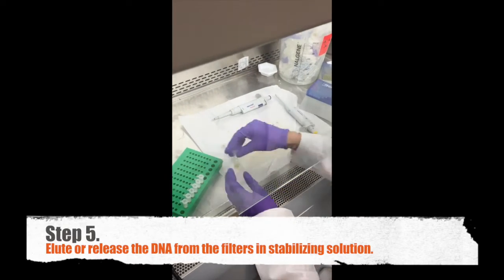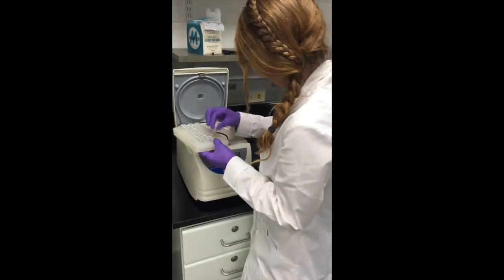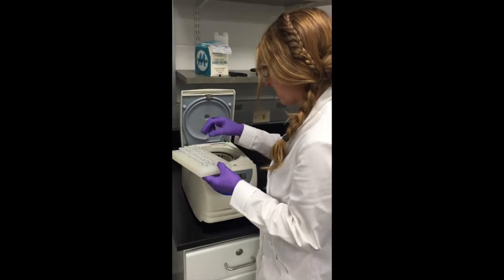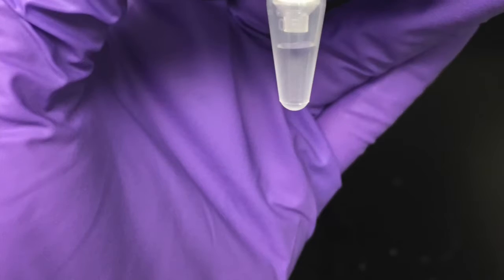Step five: Now I elute the DNA so that it passes through these filters with a special buffer to keep it stable in storage. And here it is — a tube of purified DNA extract.